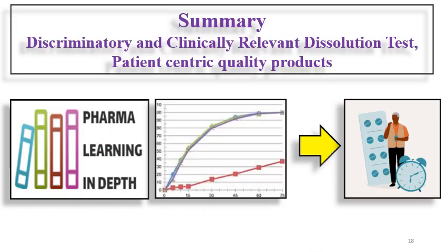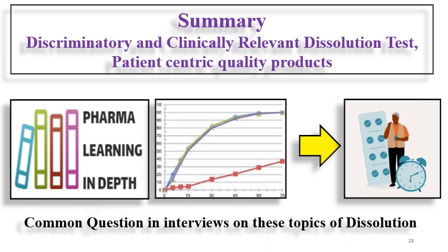So this is regarding the discriminatory and clinically relevant dissolution test, and this dissolution discrimination and clinical relevance is now going towards patient-centric quality products.